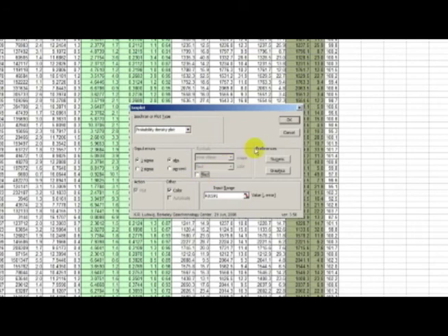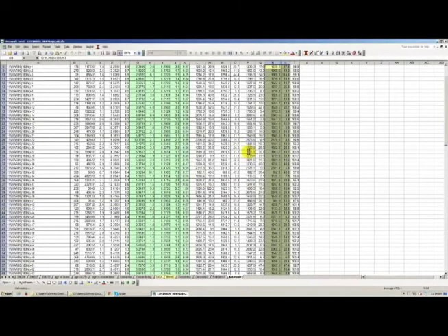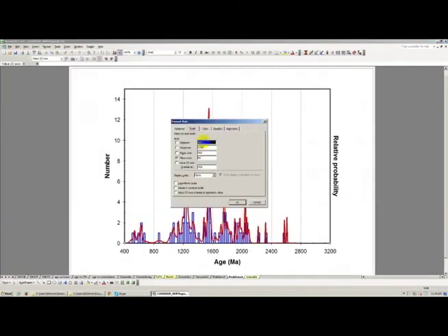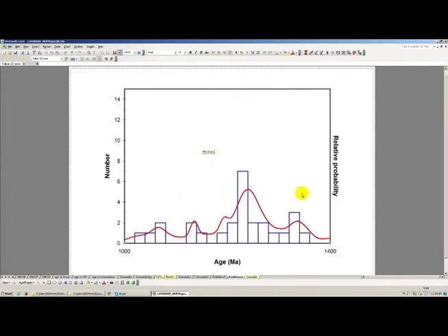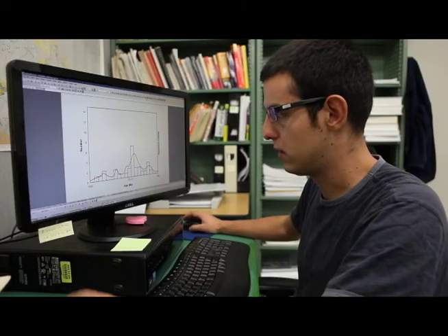So this probability density plot is not going to be filled. If you rescale it again, it has no problem rescaling the histogram bars, so you don't have to worry about rescaling the filled symbols.